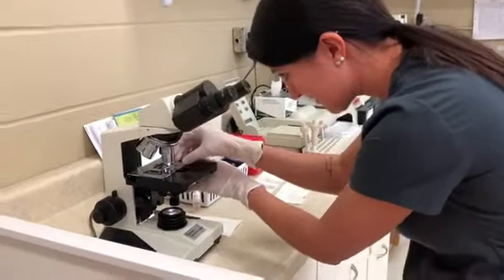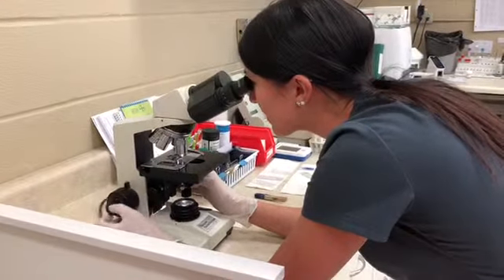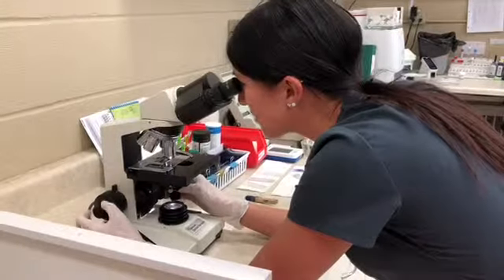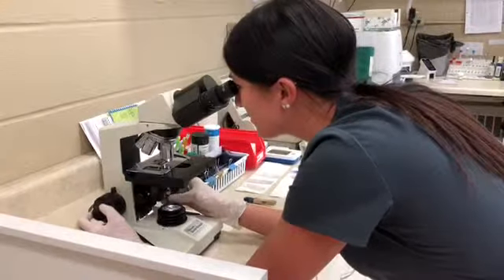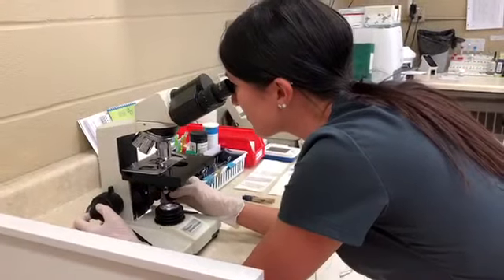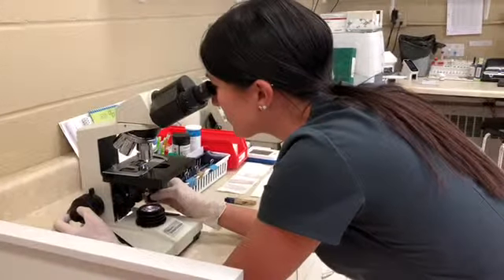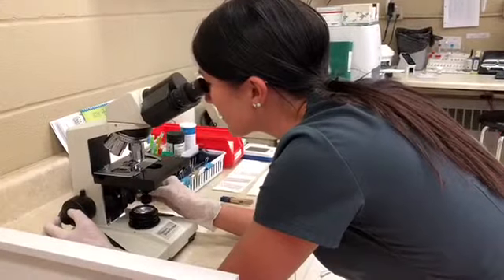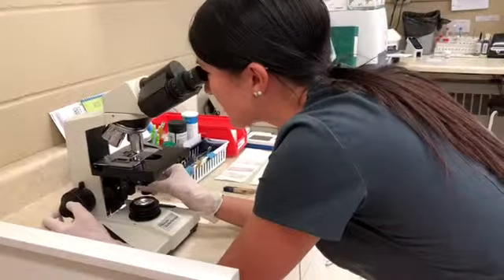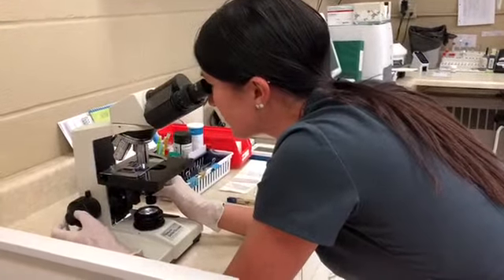Under 10x power, we'll go ahead and take a look at our sample here and focus it in. There we go — now we're focused. Take a look around. You do want to make sure that you look at it under all three powers. I am seeing some things in here, so I'm going to move up to 40x and focus it in.